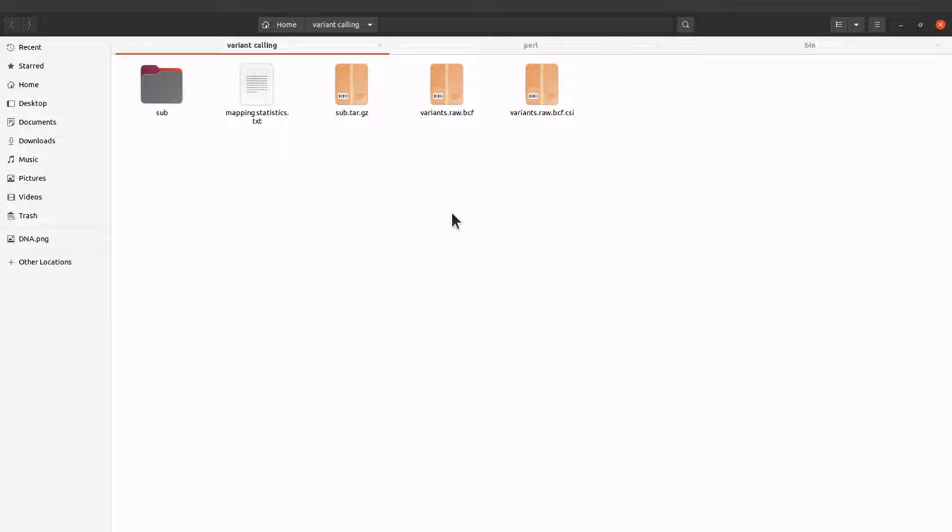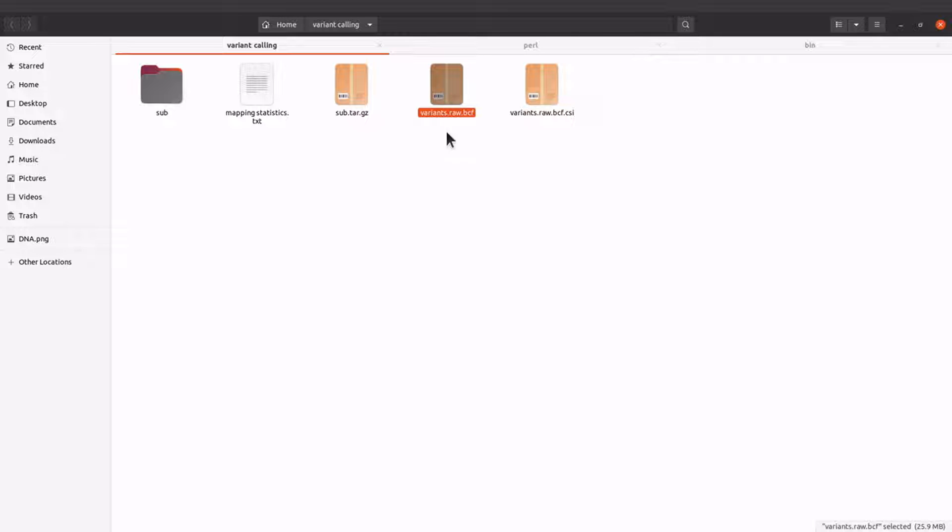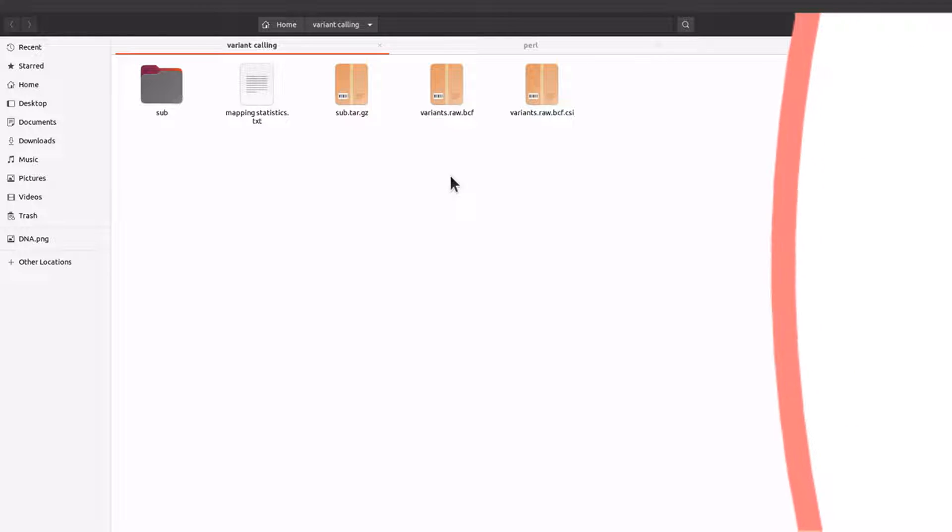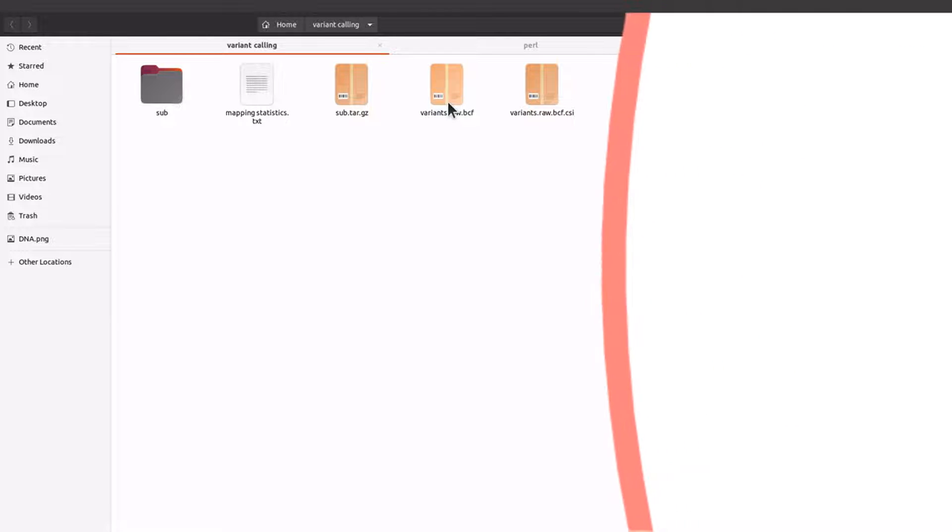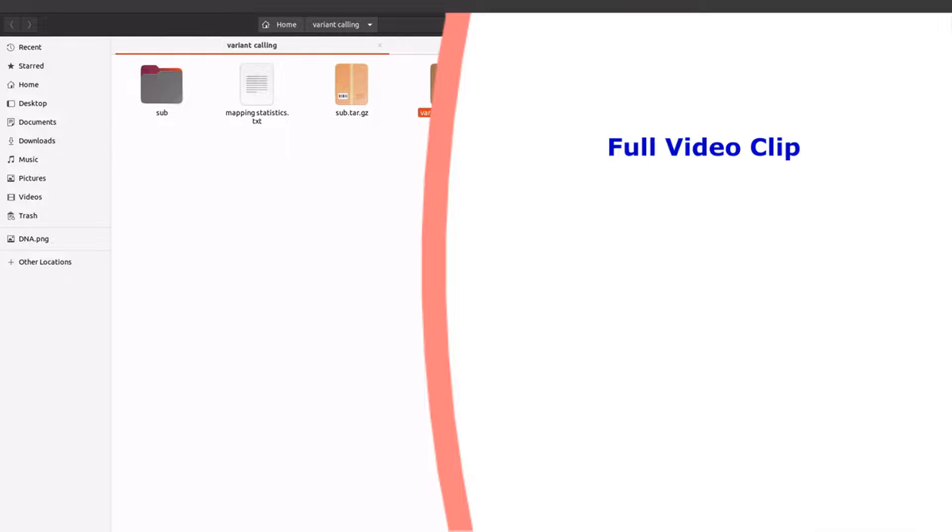This is in the BCF format. If you are going to analyze this file using bcftools then you can leave it in this format. But if you are going to use other tools, then you need to convert this file into a VCF format.